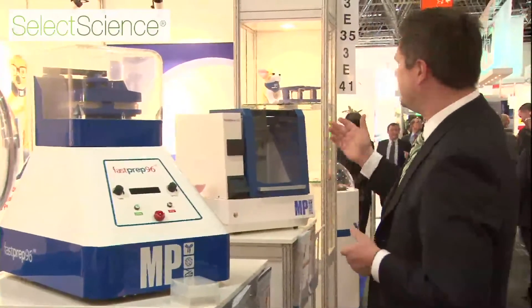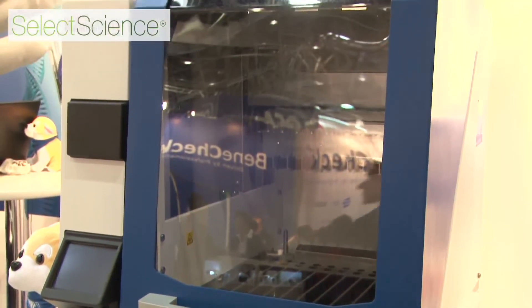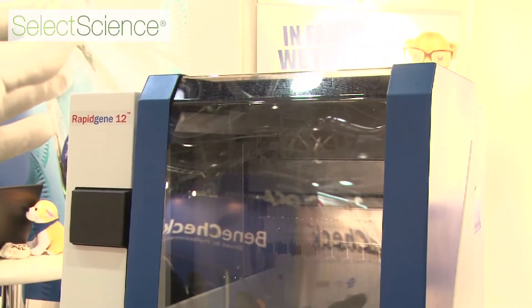The last offspring of this FastPrep family is the RapidGene-12. The RapidGene is the ultimate system for RNA and DNA purification. It is a self-contained system that works with cartridges based on magnetic bead technology. You could even put blood samples in, and after 30 to 45 minutes depending on the program, you get the tube of your desired DNA or RNA product.